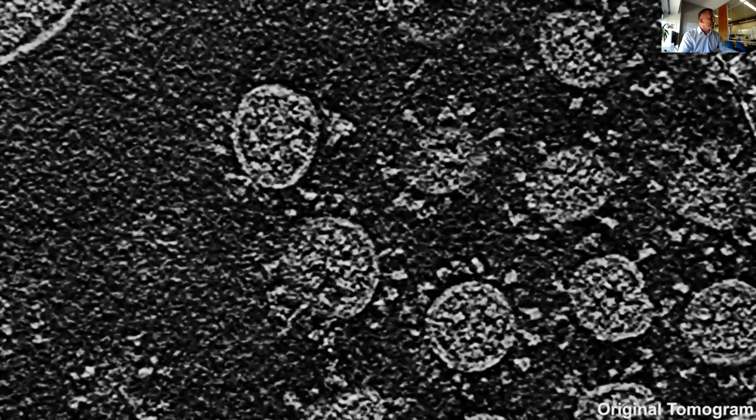If you don't mind, I move this on this other side. However, you can still see that there is a lot of noise, and this noise is somehow occluding the interesting structure. In 2D, we can see the specimen. You can imagine that in 3D, all these little speckles which are here will be occluding the specimen, which is kind of centered in the middle of the volumetric tomographic reconstruction.